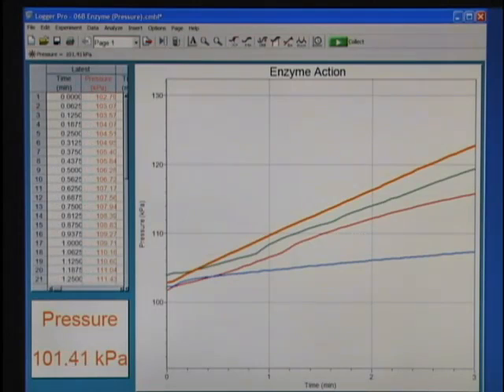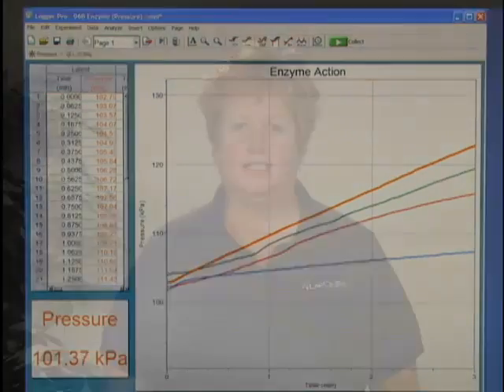With all of the data on one graph, it is very clear that the rate of oxygen production increases with the amount of enzyme catalase present.